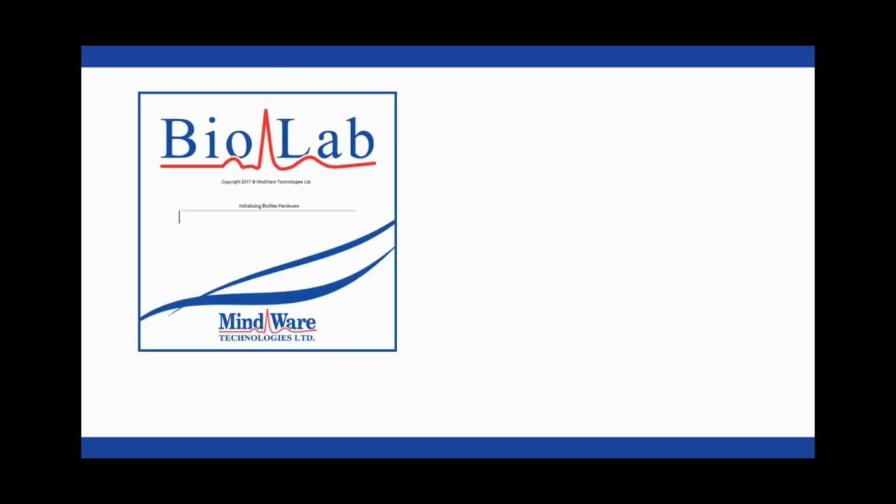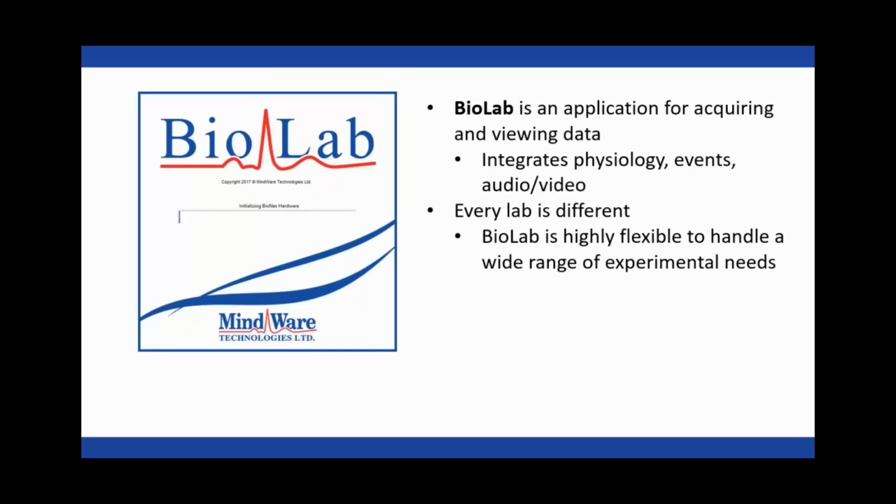We'll start by doing a recap, since this is the third part of the series of webinars on BioLab, and what we covered so far. We learned that BioLab is an application for acquiring and viewing data. It's the center of integration for MindWare equipment.